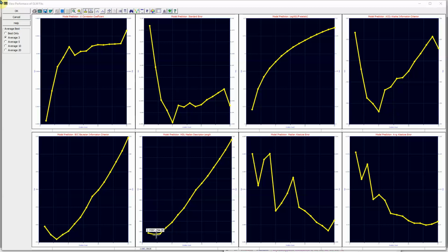The minimum description length best at 2. And as far as the median and the average errors go, you see very high parameter counts as its optimum. Now, often these different metrics will show a good agreement, especially with very difficult to model spectra. Here, because the fit is so effective with just a single predictor, there's a much wider variation.